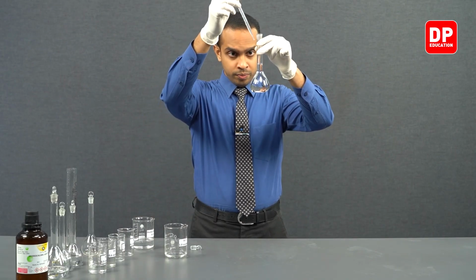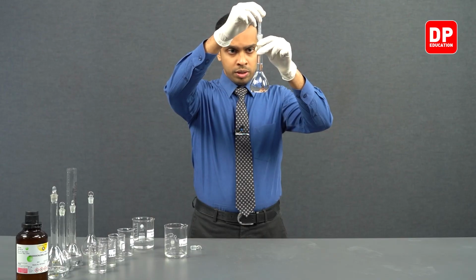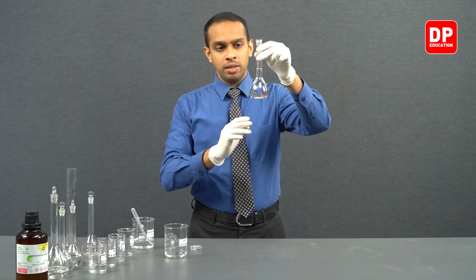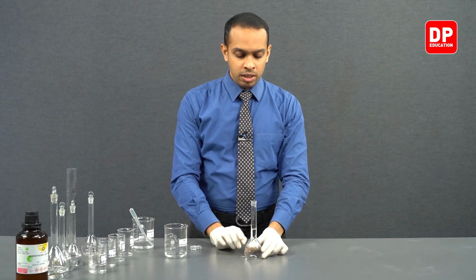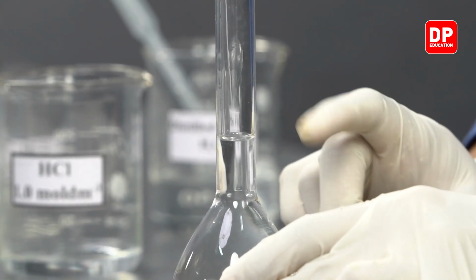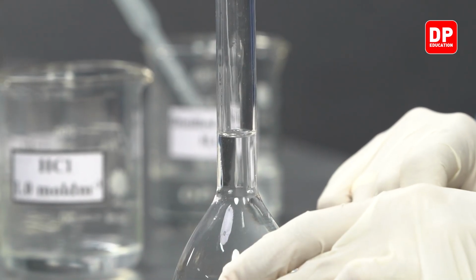You can see, when you're trying to make sure that you don't add too much water, you have to bring it to your eye level and use a dropper to add the right amount of water. Now you can see the bottom of the meniscus aligns perfectly with the calibrated mark.